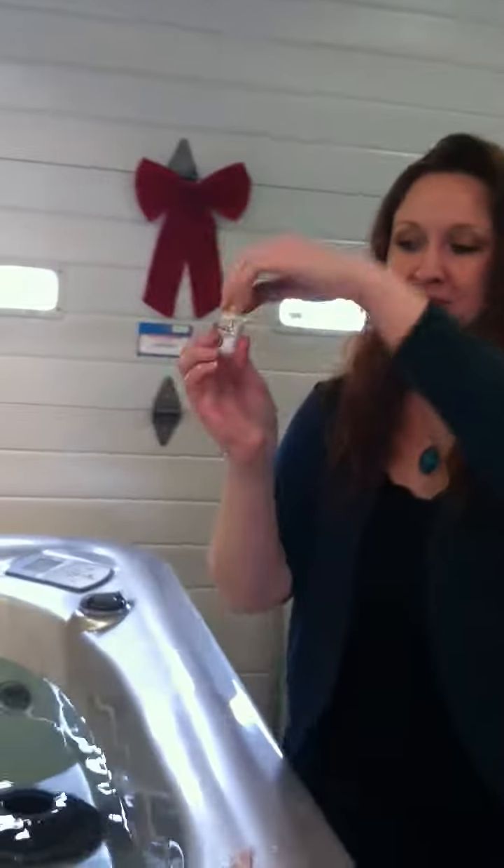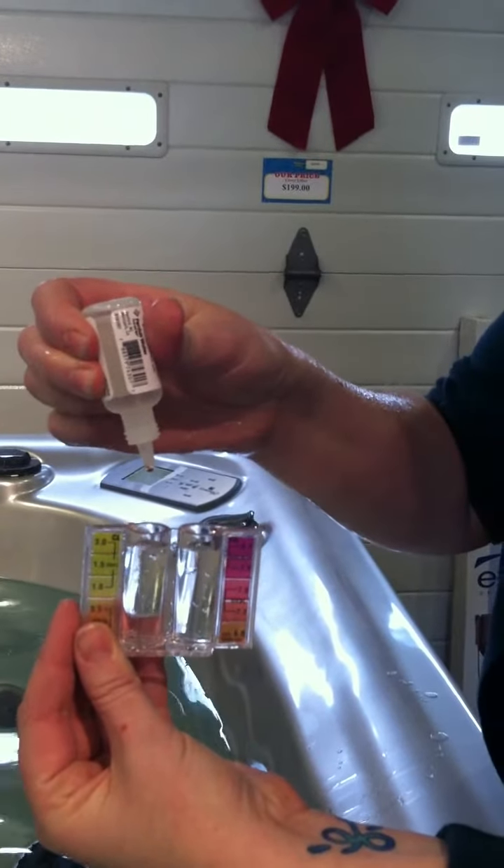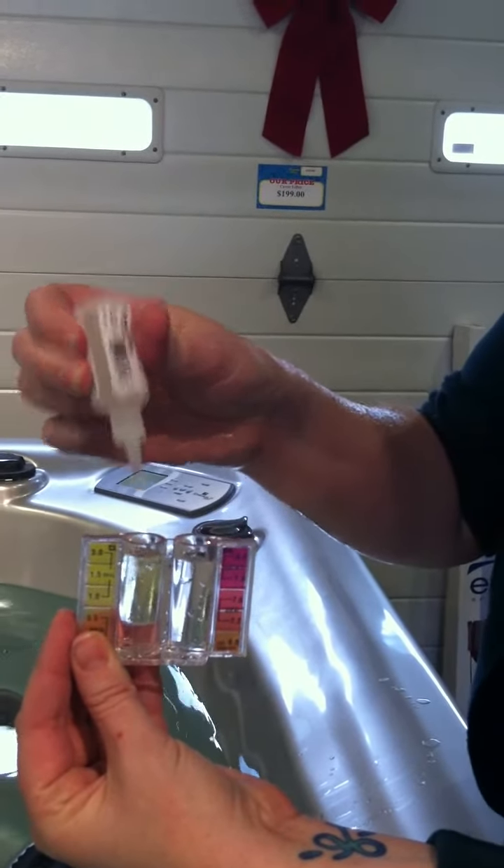Then you're going to take your OTO solution for bromine or chlorine, whichever sanitizer you have, and you're going to do five drops on the yellow side, holding the bottle straight up and down — very important so you get the same drop size every time. Then you put your little cap on.